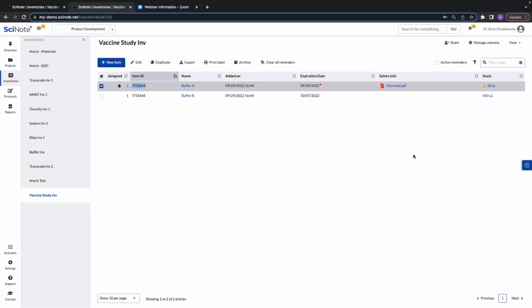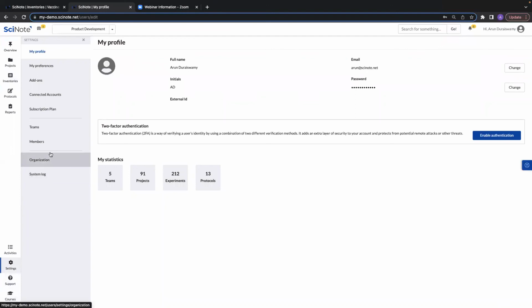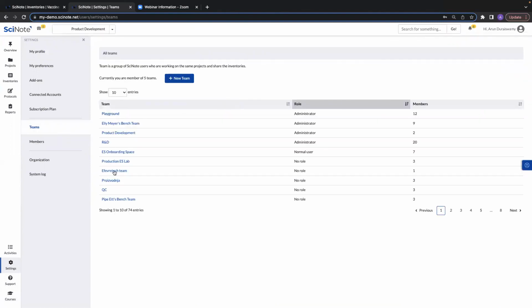If we go into your audit trail, I believe it just says that there was an edit to the file. Yep, that's correct. It does not say what the edit is. It just says that there were changes made.